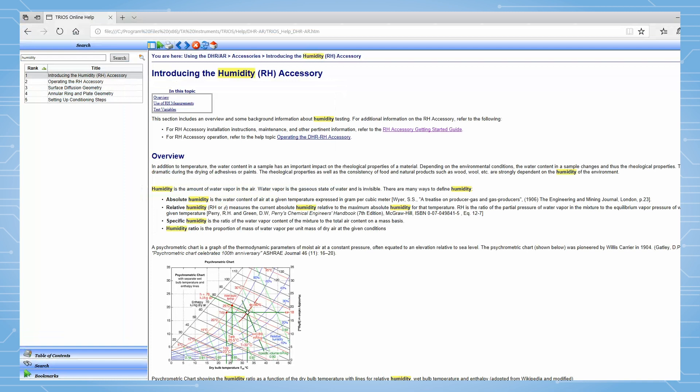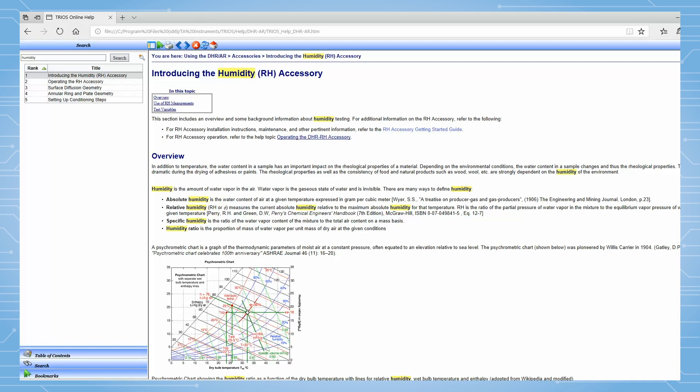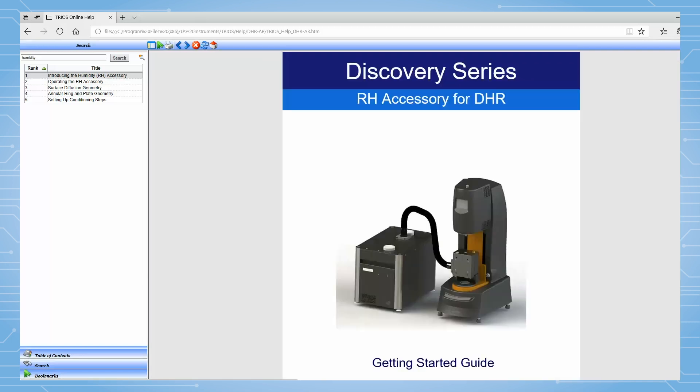First of all, please follow the DHR-RH getting started guide manual and the RH accessory setup tech tip to properly install the humidity generator and humidity chamber.